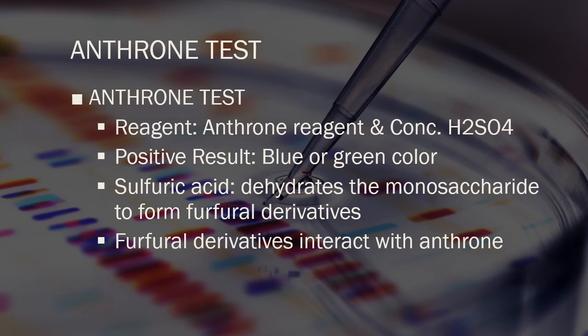The reagents used here are your anthrone reagent and your concentrated sulfuric acid. Okay, so that is for that one.